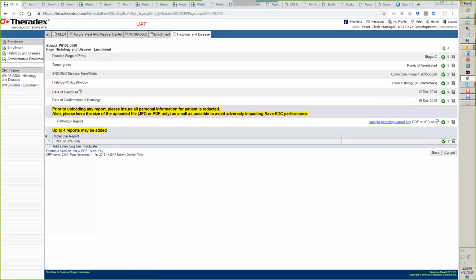I'm not sure if that was intended or just accidental that these remain editable. Do you find that it would be useful for you guys to be able to upload reports here, or do you think that maybe we should just turn off the editing for these fields?